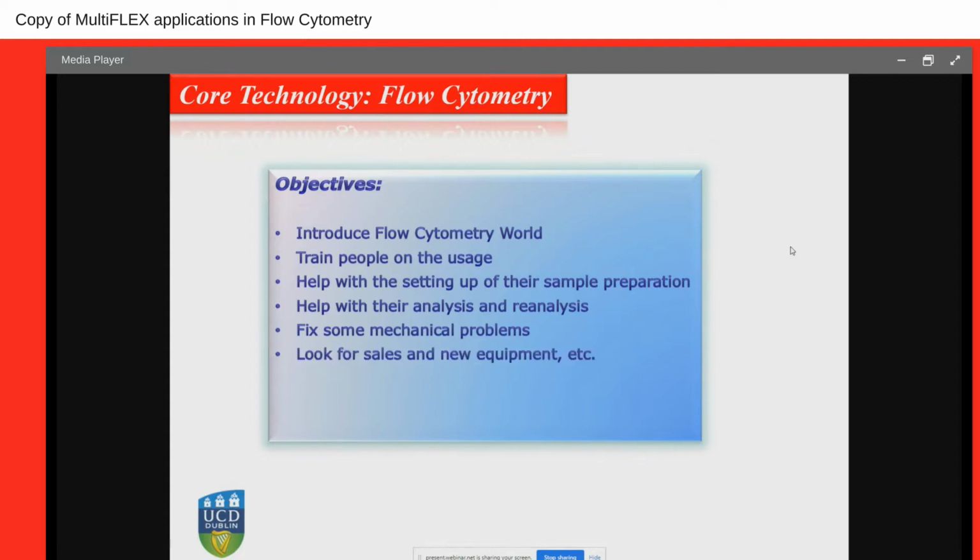Of course, one of the things we have to do before we buy the instrument is make some research and look at which offers are available on the market, what the pros and the cons are. Every single instrument has big benefits and not so good ones. So pros and cons. It's like buying a car. When we are buying a car, we have our favorite one. Also, we look at the budget, but at the end of the day, we have to look at whether it will be the perfect one for my applications, for what I want to do.